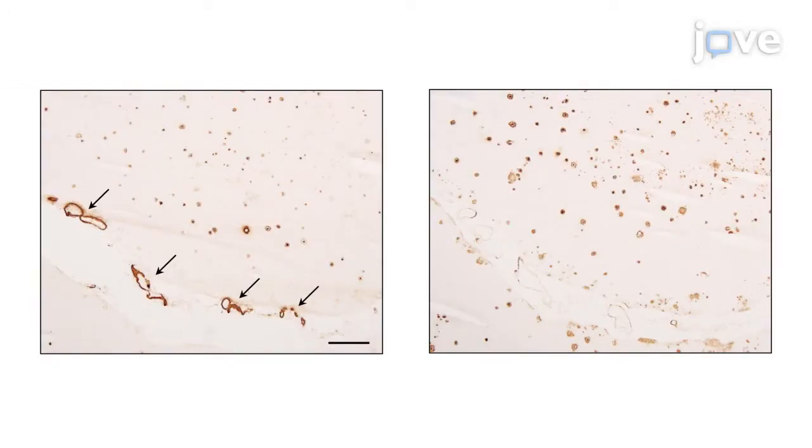Distributions of amyloid beta 1 to 40 and amyloid beta 1 to 42 were further validated with immunohistochemistry using adjacent frozen sections of the tissues. The anti-amyloid beta 1 to 40 antibody labeled CAA and revealed amyloid beta 1 to 40 is preferentially deposited in leptomeningeal blood vessels, which is in clear contrast to the distribution of amyloid beta 1 to 42 in the cerebral parenchyma as senile plaques.